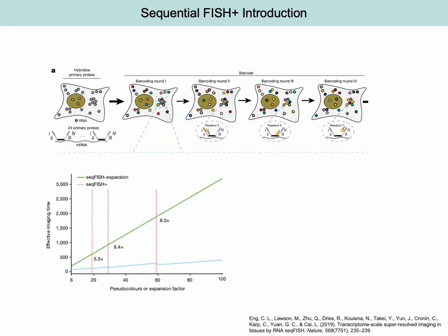And in here, SeqFISH is already a pretty impressive tool, but it is pretty hard to apply this to targets of more than 10,000, due to the optical density of the transcripts in the cells, and as I mentioned, each mRNA or each dot occupies a diffraction limit spot in the image.